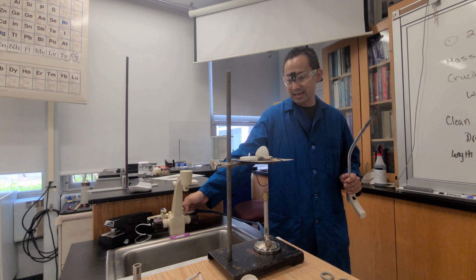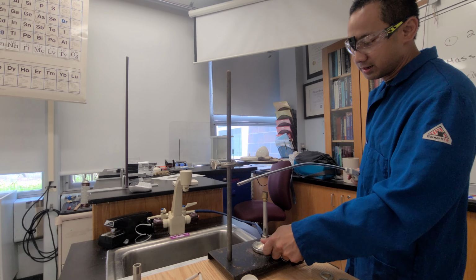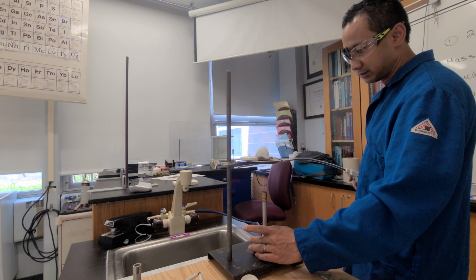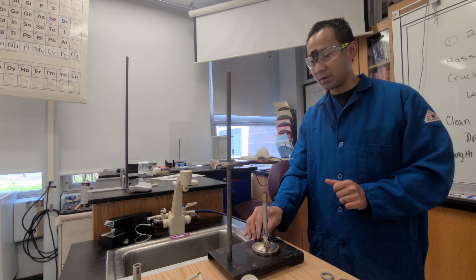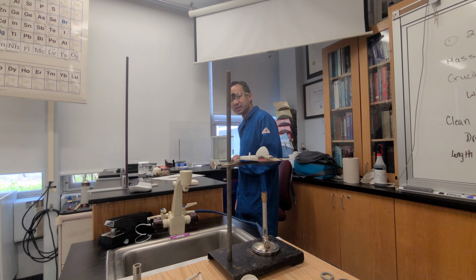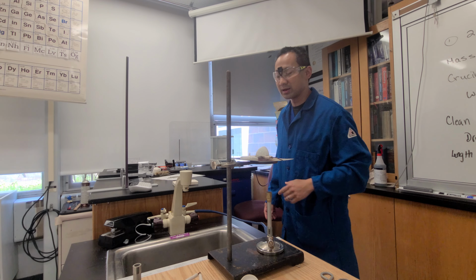So I'm going to light this up again, making sure that I hear gas. No gas there. Now I'm going to open this up. What I normally do is when I open it up, this is fully open, and then I just hold my fingers over top of it, and that will light it up. So I tend to do a 3-finger distance, so like this, an easy 3, okay, maybe a tight, but easy 3. Okay, and I'm just warming that up.